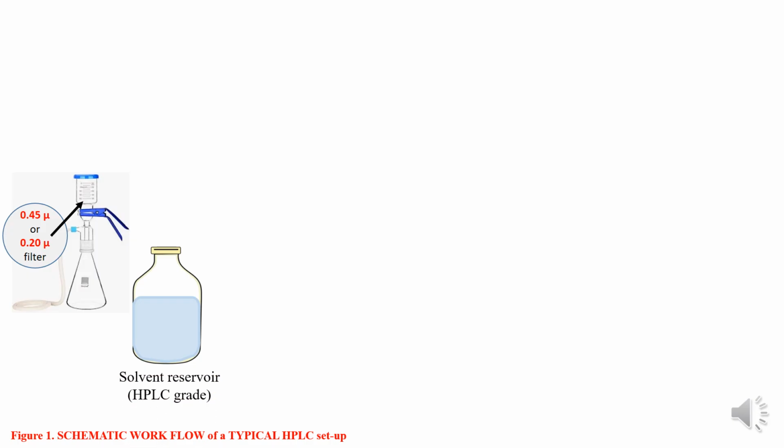Now, the solvents used for HPLC should be of analytical grade or HPLC grade. HPLC grade solvents are commercially available. Some of the commercially available polar solvents are water, methanol, and acetonitrile.